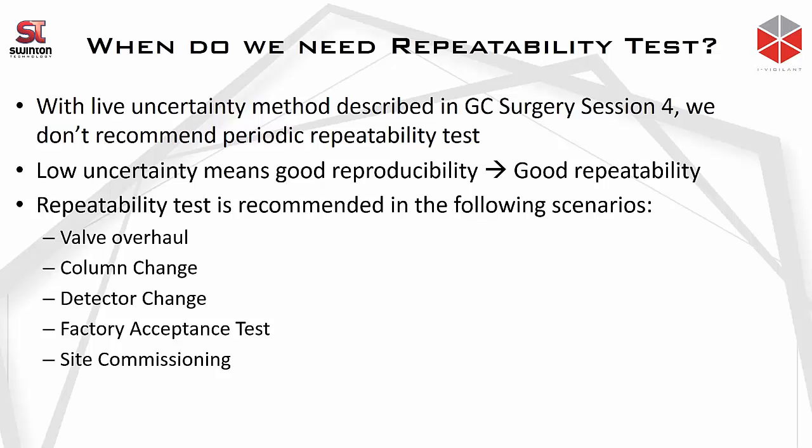So every time we do something big to the GC, such as changing the diaphragm on the valve, changing the column, or installing a new GC, we need to make sure that the GC will work properly after the installation. One of the ways to do that is to perform a repeatability test. Therefore, repeatability tests still have their place.